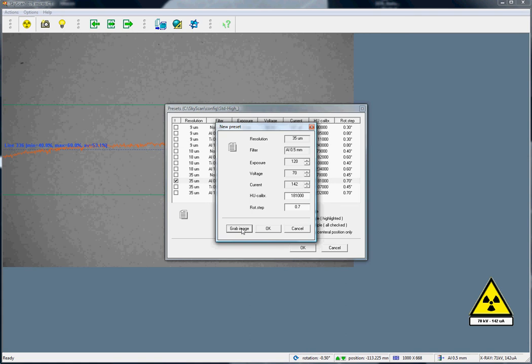Please note, the exposure time should only be adjusted in this way, when you are looking at the raw image and optimizing the raw image to a value of 50%. Please do not use the exposure time as a method of changing the image.